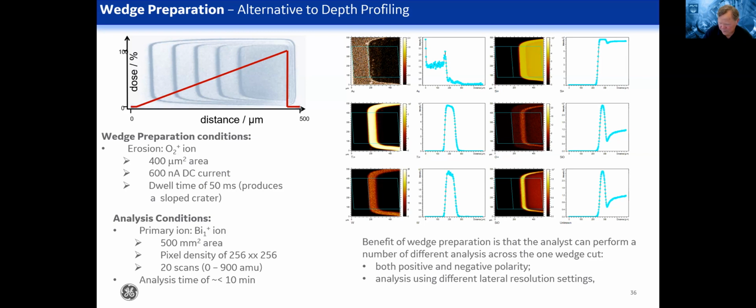With ToF-SIMS compared to dynamic SIMS for depth profiling, you may not have as high a chemical sensitivity for certain species, but I haven't run into a situation where we weren't able to get useful information.